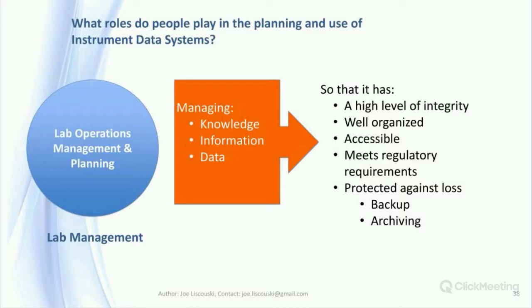Lab management has responsibility for the overall ability of the lab or laboratories to meet their organization's responsibilities. That includes managing operations within the lab, responsibilities to groups the lab may be supporting, and those organizations they may be collaborating with. Among the key assets that the lab works with and produces are knowledge, information, and data.